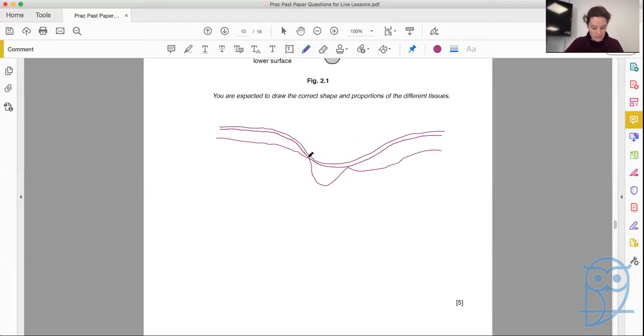So then we come and we have another sort of scoop here. And around that, there's another scoop. And around that, if we look carefully, down here, there's another scoop. Okay. Then from about here, we go off with our spongy mesophyll in the blade of the leaf. And the same thing on this side, though, there's some more fun and games happening here. We've got another vascular bundle here in the specimen that we're drawing, okay?